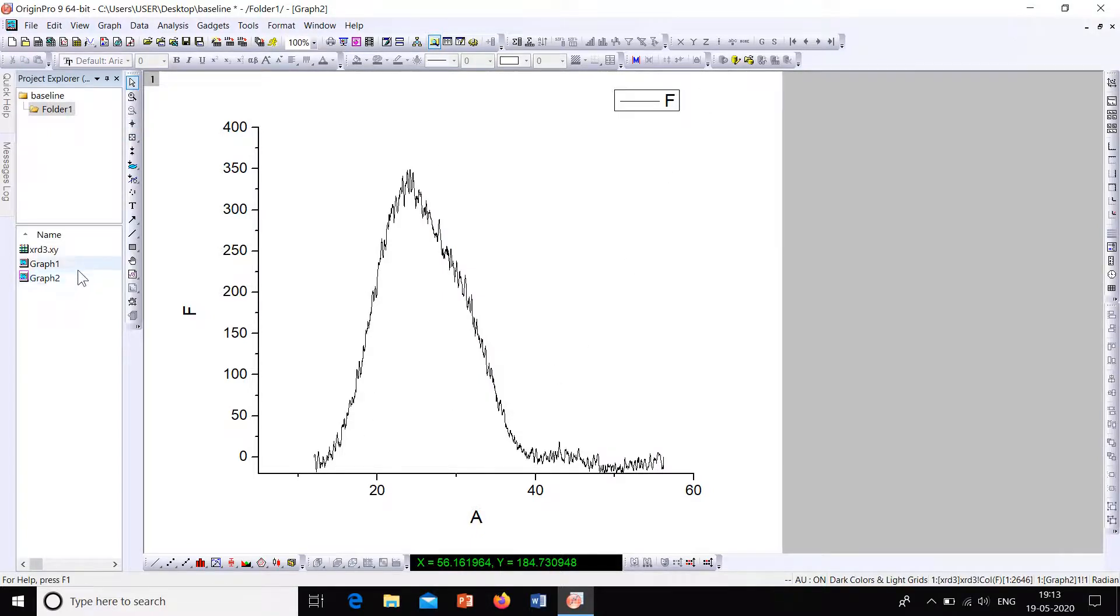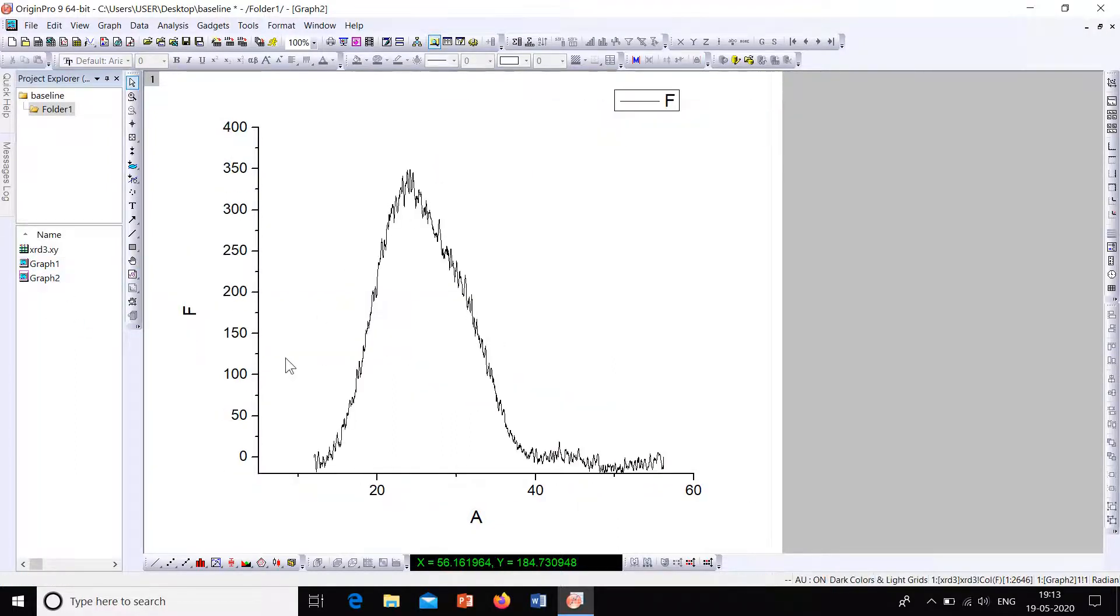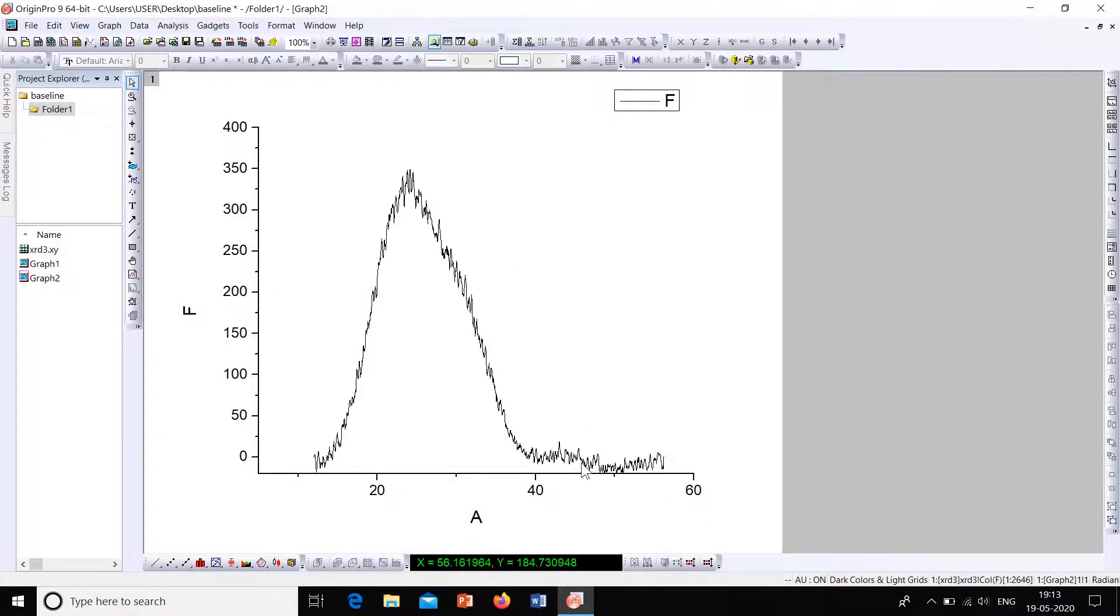So you can see the difference here. This is the original graph, and this is the baseline corrected graph. So you can do better baseline correction by changing the number of points.